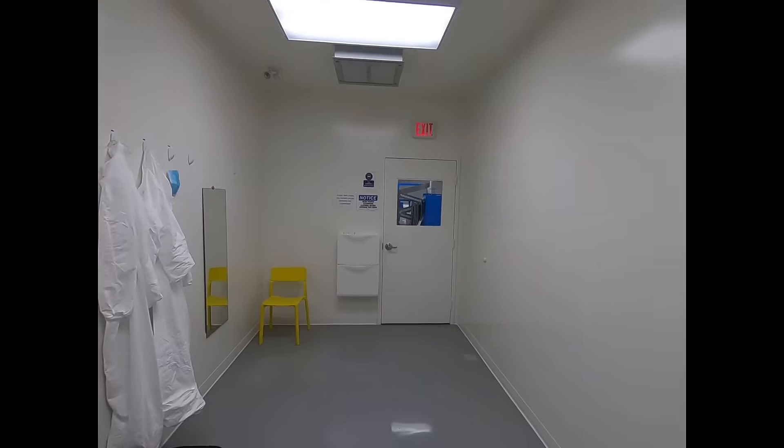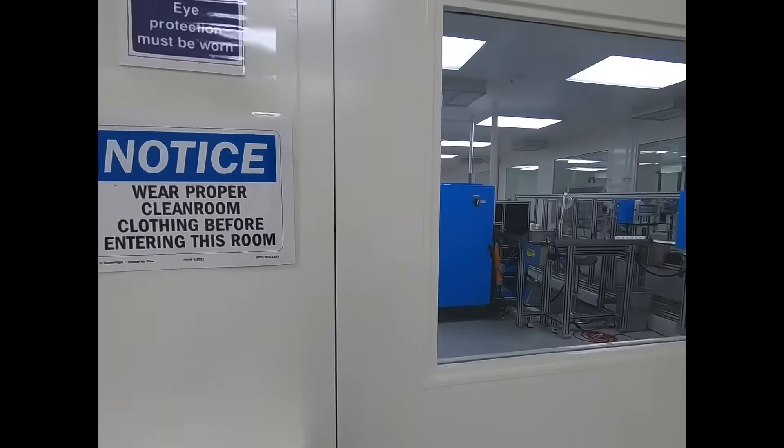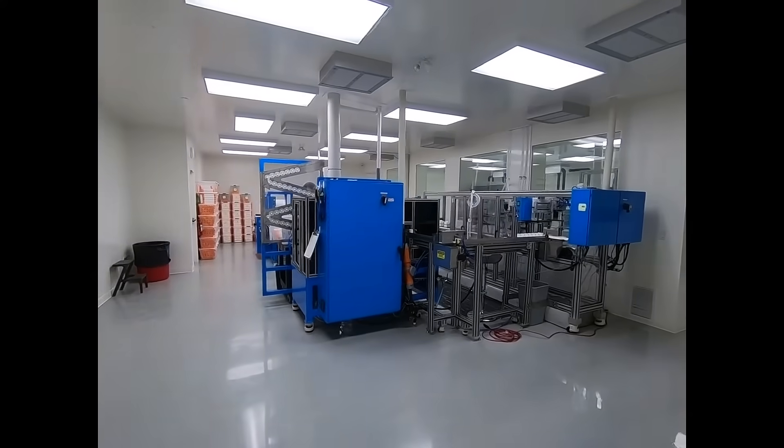All of Watera's filters are produced in our sophisticated clean room manufacturing facility in Calgary, Alberta, Canada.